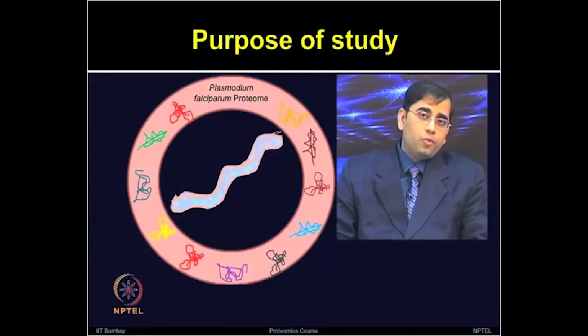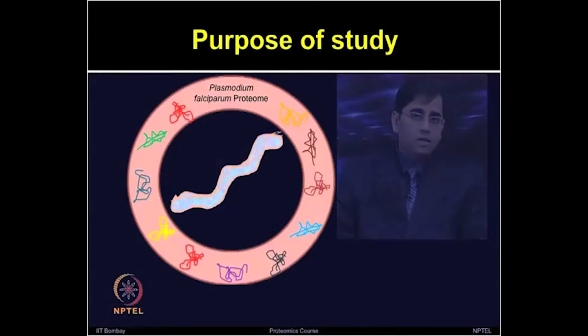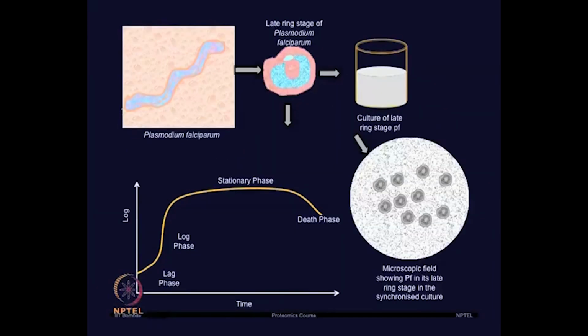So, certain proteins were found to be commonly upregulated due to both of these drugs, and certain proteins had different patterns. But before looking at the proteomic alterations, the authors first determined IC10, IC20, IC50 and IC90 values for both the drugs, ARM and LUM.